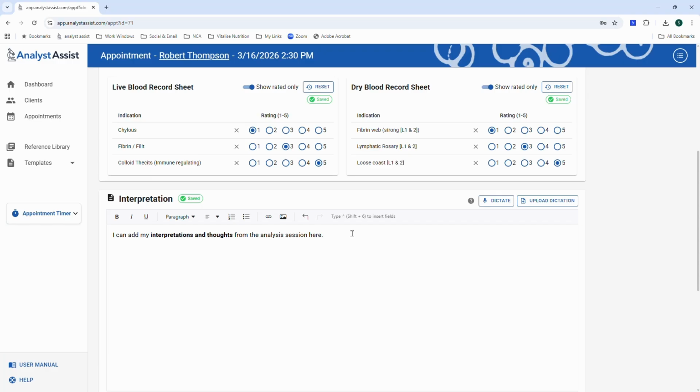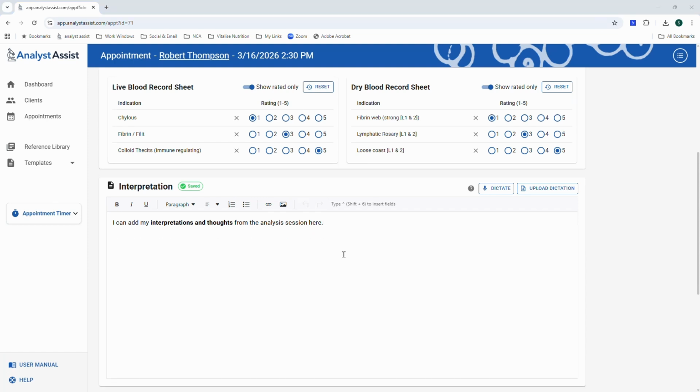The other powerful feature that these DRTE panels include is AI-powered dictation. This is in two forms. The first is live dictation via a microphone connected to your computer, which records and automatically punctuates text, adding it to the panel as you speak. The second option is by uploading a pre-recorded .wav audio file produced using a recording device or dictation app on your phone. For now, we will demonstrate the live dictation process.